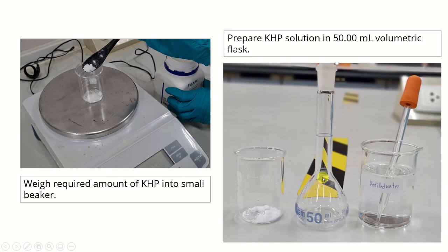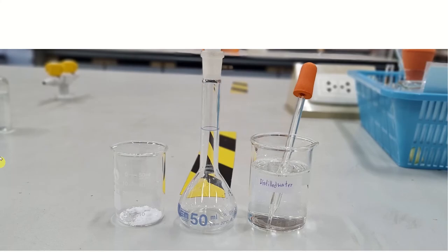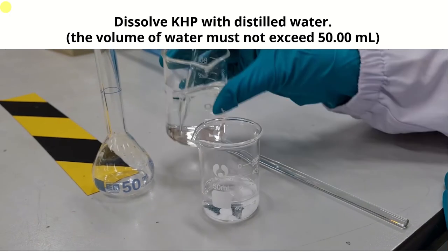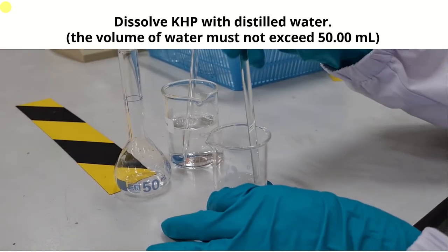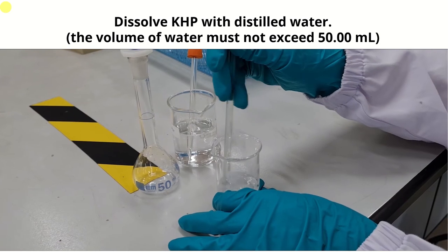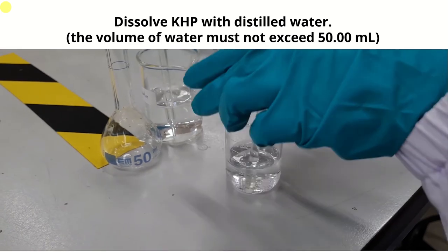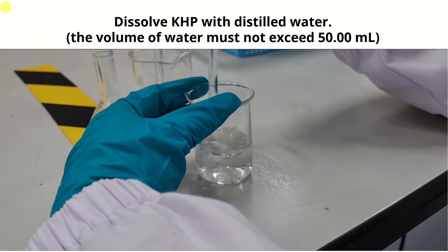And then of course, when you want to prepare solution, you need 50 milliliter. So you bring the volumetric flask, 50 milliliter. This is the required amount of KHP, and take distilled water to prepare solution. Prepare the solution by following the step here. Dissolve KHP with distilled water. You may need to add more water if KHP is not fully dissolved.